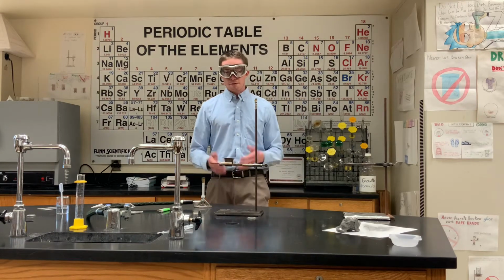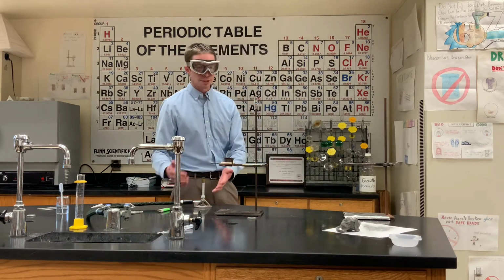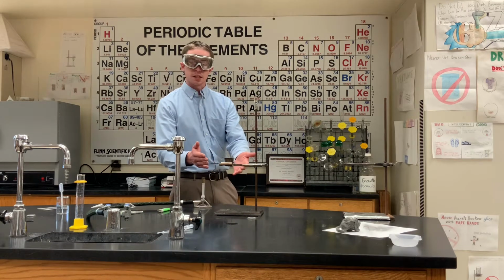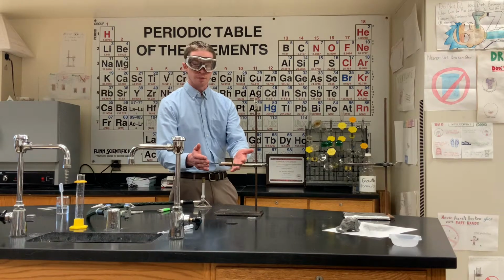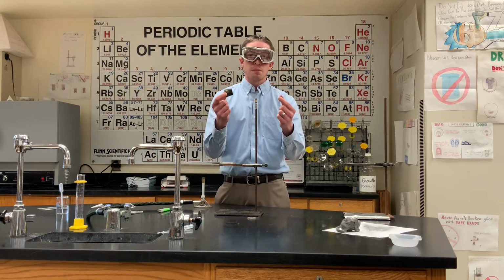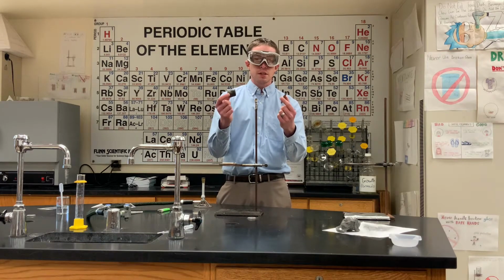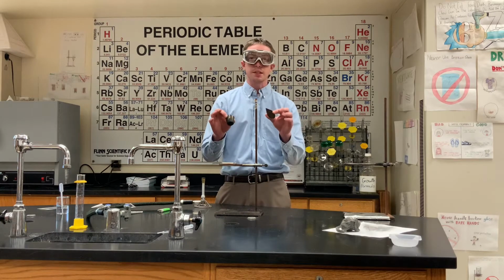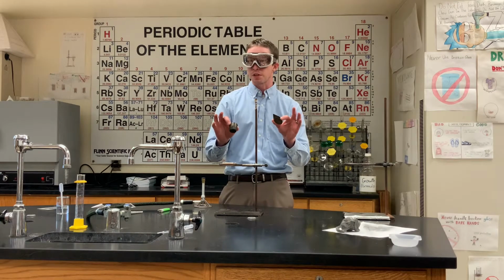So here we have our lab set up. We have our Bunsen burner over here. We have our ring stand with our iron ring, and then sitting on top of the iron ring is a pipe stem triangle. And then inside the pipe stem triangle is a crucible. Most crucibles are made out of porcelain. This crucible happens to be made out of stainless steel. It's a lot more durable, and it's actually going to allow this lab to happen a lot more efficiently.